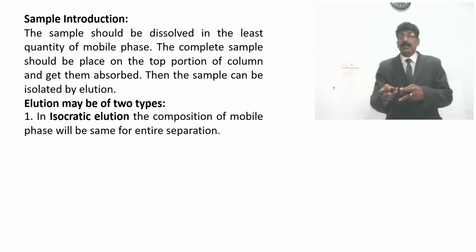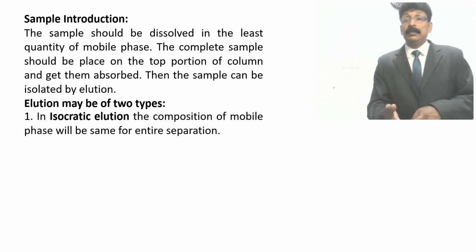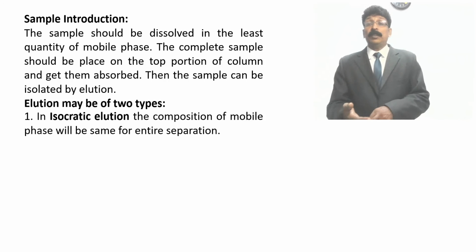Like petroleum ether, benzene, chloroform, carbon tetrachloride, methyl acetate, or before that acetone, and also methanol, ethanol, and dilute acids. Like that you should know how the polarity increases.